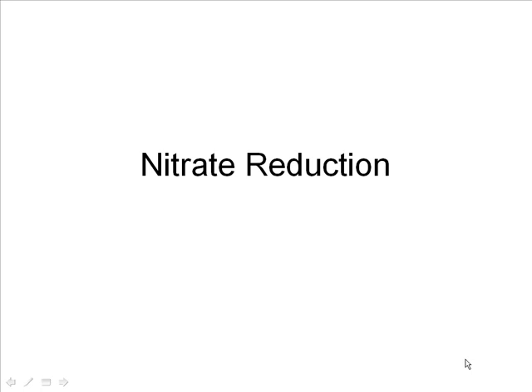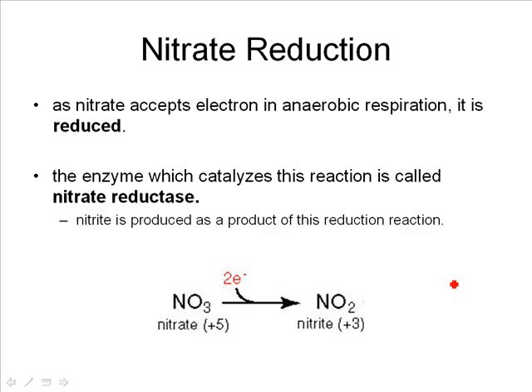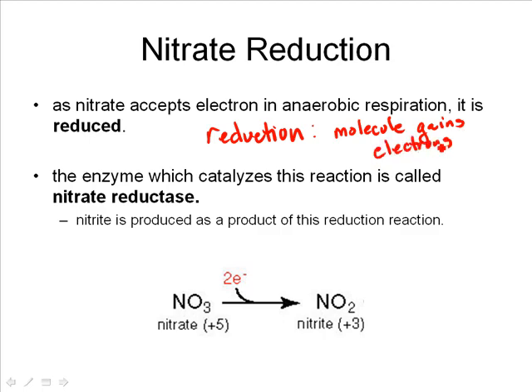Alright, let's discuss nitrate reduction. Now, nitrate, as I talked to you about, was one of those final electron acceptors. Now remember, from chemistry, in a reduction reaction, an atom or molecule gains electrons. So in this case, when nitrate is the final electron acceptor, it is reduced.